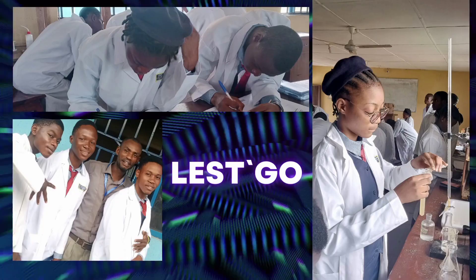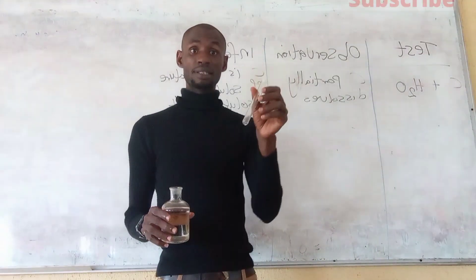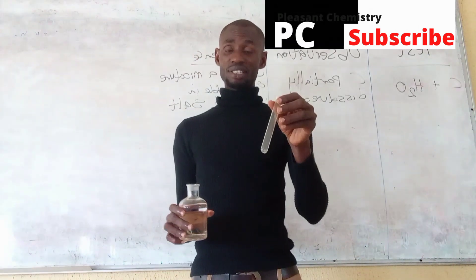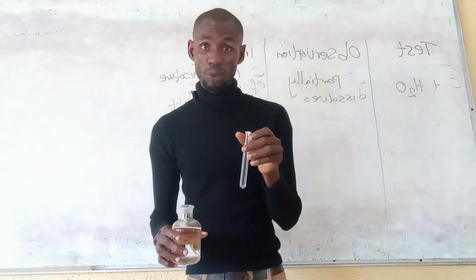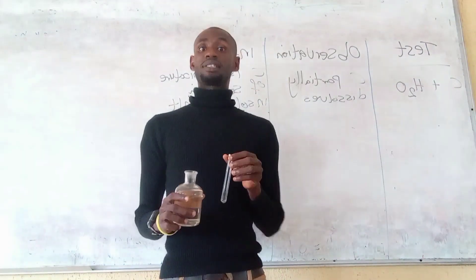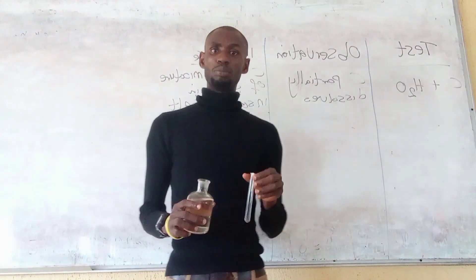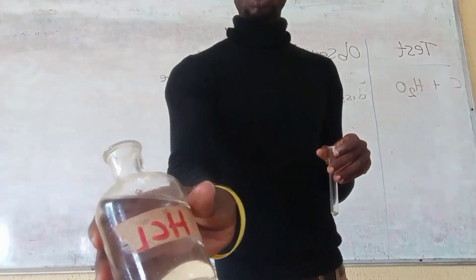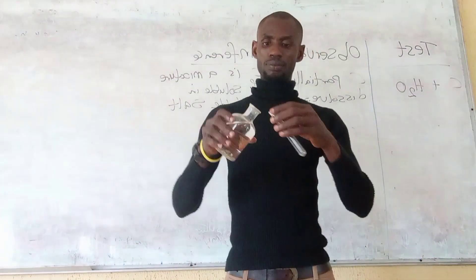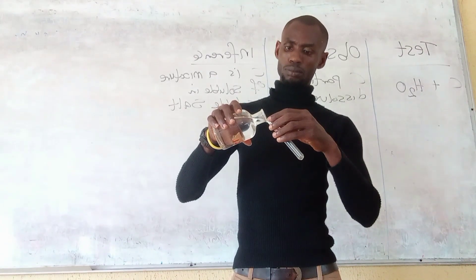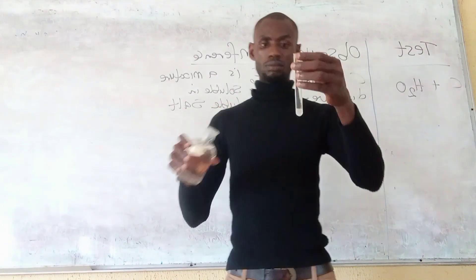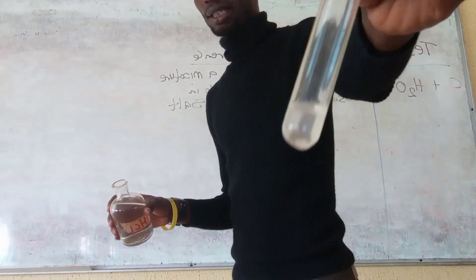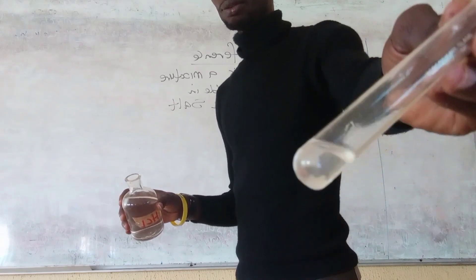This is our residue. Since the residue is insoluble in water, we are going to add acid — specifically hydrochloric acid (HCl) — to the residue. Look at it — you can see it boiling, there is effervescence occurring.